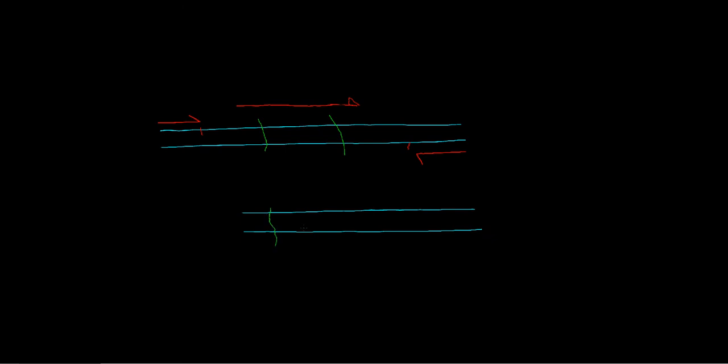Let's just talk about this real quick. I'm trying to decide on a color, pink. So we have this forward primer. The combination of this forward primer here, which we'll call 2F, and 2R, are going to give us this chunk.